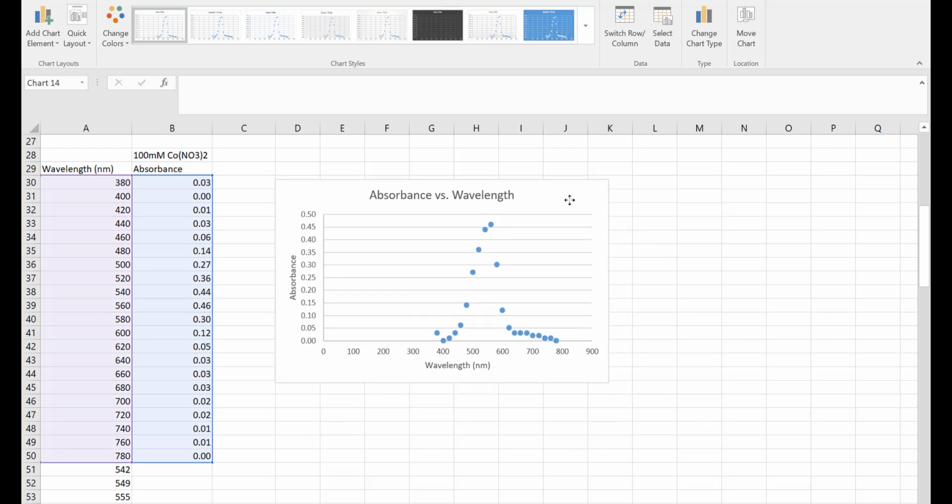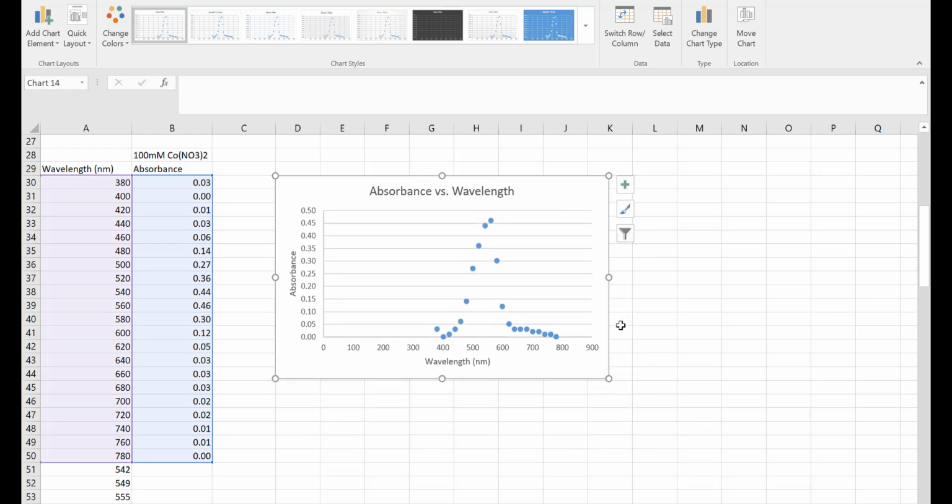So my graph is already looking fairly nice. Again, spectrophotometers here very often would just automate this procedure for you. It can even sense in real time, as I send in all these wavelengths here, how this particular chemical actually responds. Depending on the particular chemical, it will have a very unique wavelength that has max absorbance. That particular wavelength here, we're going to call it a lambda max.